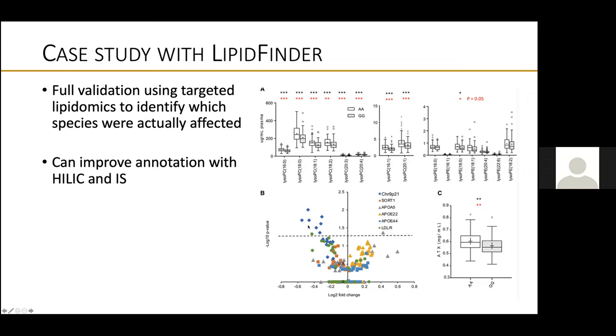And we then went back and, using the Orbitrap and the untargeted approach, we pulled out putative lysophospholipid matches in a number of other risk SNPs and showed that they don't really show any fold change differences or significance. These ones here all belong to the chromosome 9p21 SNP, showing that it seems to be really unique to that risk SNP in terms of cardiovascular risk. So that's just an illustration of how we've used this approach in a non-hypothesis generating way.